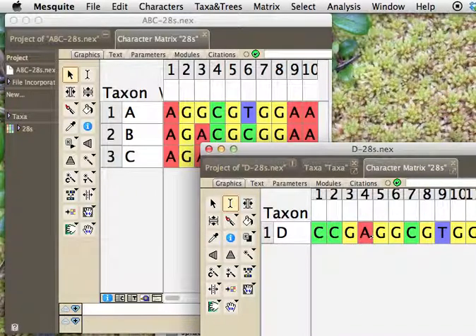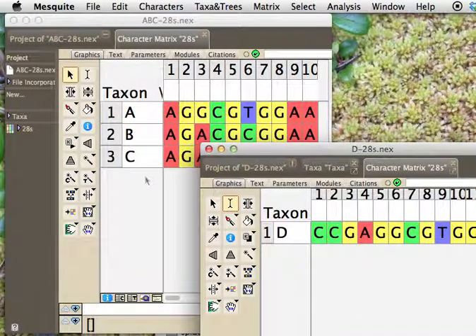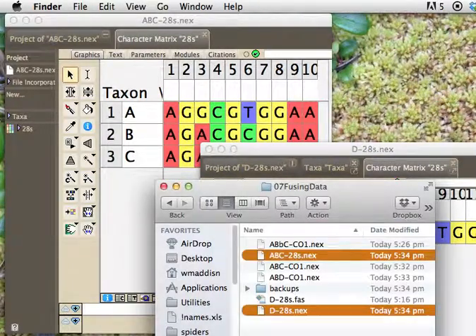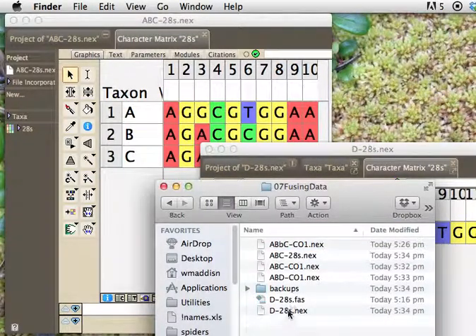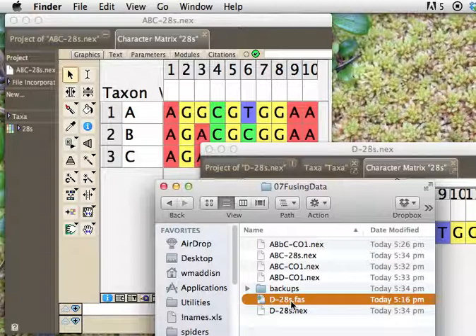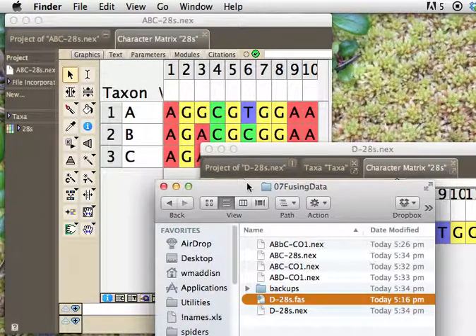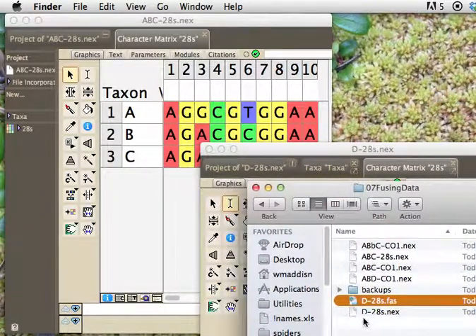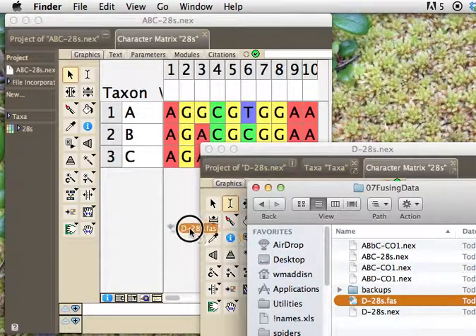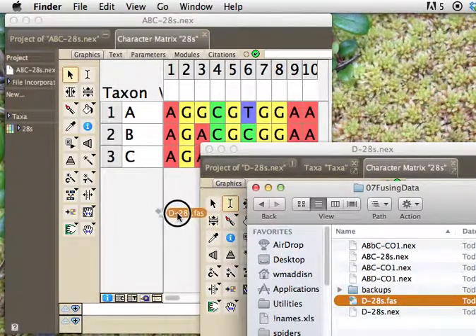Now, it would be nice if we could just do something like grab it here and drag it across there, but that isn't possible yet in Mesquite, and so we're going to do it at the file level. One of the easy ways to do this is to save the file as a FASTA file because there's a special way to import FASTA files where we just take the file here, so this is the same D file saved as FASTA, and we just drag it over top of the matrix window.